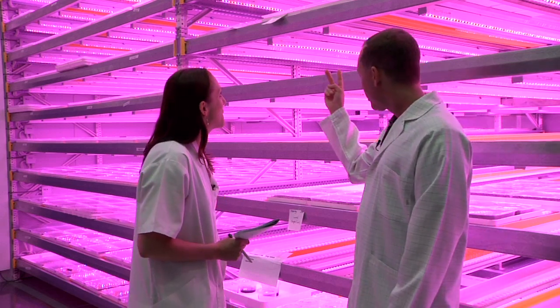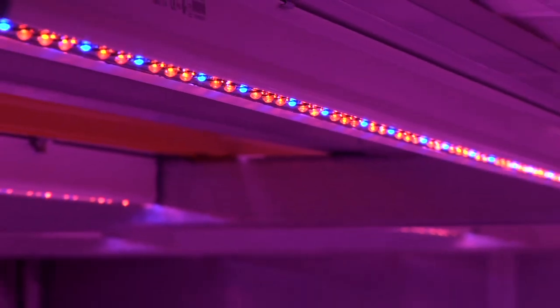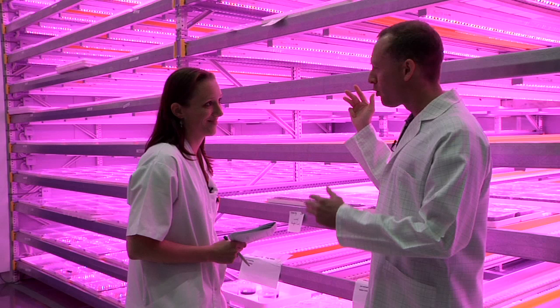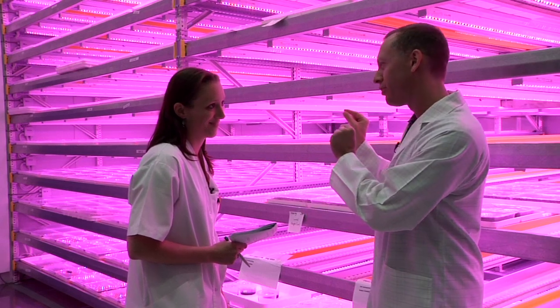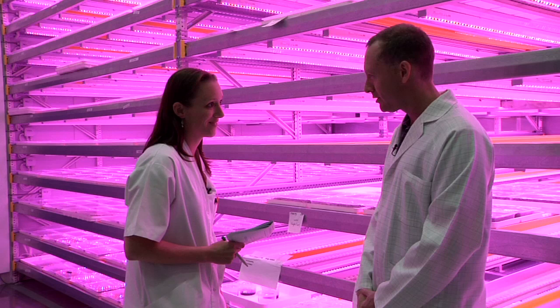What I see here is about two blue LEDs for every five red LEDs. There's no white light, no green light, no UV — we're only seeing a small part of the spectrum. And yet you're able to get good growth results because of that — is that correct? Yes, that's correct.